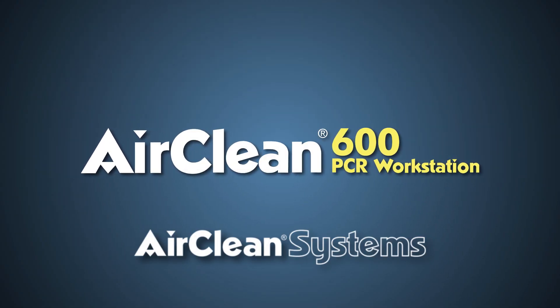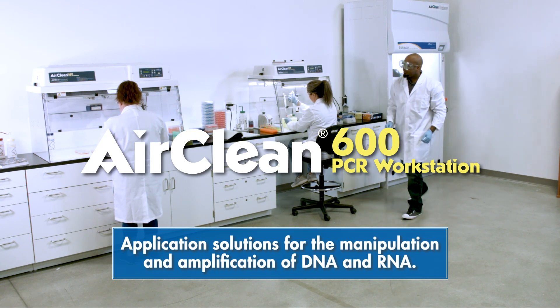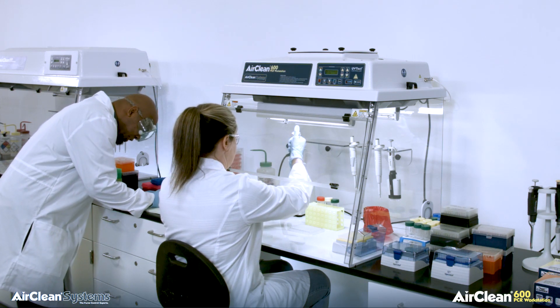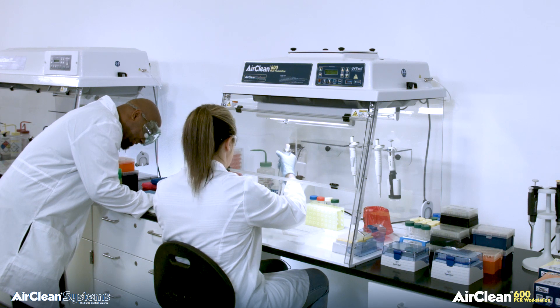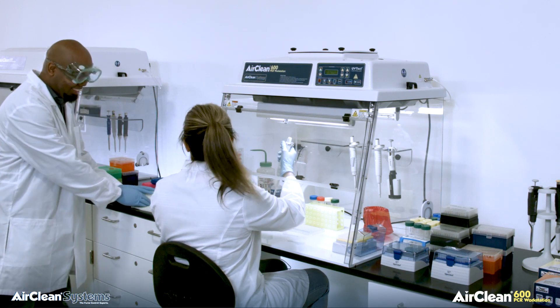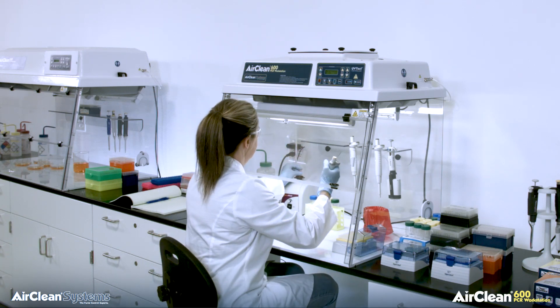AirClean Systems Combination PCR workstations are designed as application solutions for the manipulation and amplification of DNA and RNA. Cross-contamination during amplification of DNA and RNA can lead to inaccurate results, costing the lab technician valuable time and consuming expensive reagents. The AirClean Systems Combination PCR workstations offer a controlled ISO 5 work environment, improving your odds and reducing the amounts of reagents required to achieve your desired results.